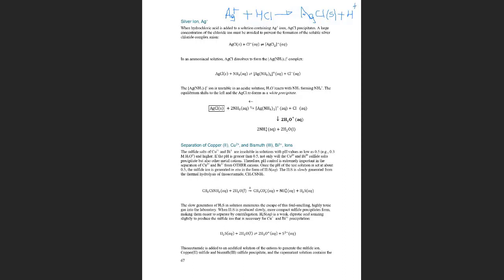So if you have the ion in the solution and you add hydrochloric acid, you are going to see in the tube a white precipitate, or the test tube is going to become opaque. Why is this second reaction here? Because they want to tell you that if you add too much acid, it's going to dissolve, forming this complex ion. So this experiment is a little bit about learning the different reactions to identify the 6 ions.